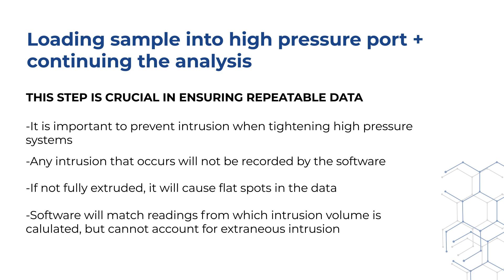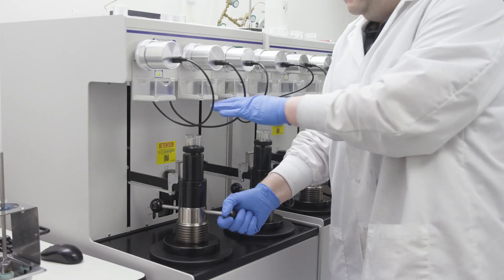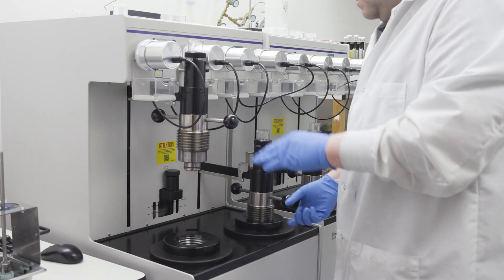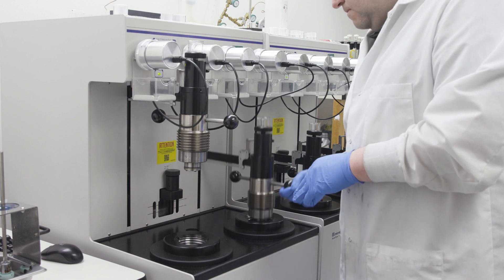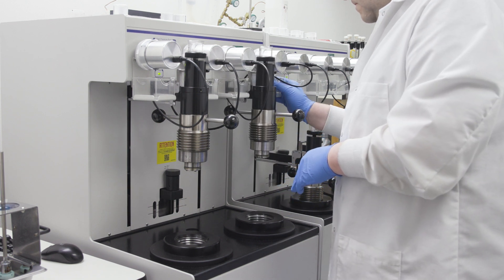The high-pressure port closures are lowered at this point but not sealed. Chris will raise the closures until the latch engages for each.